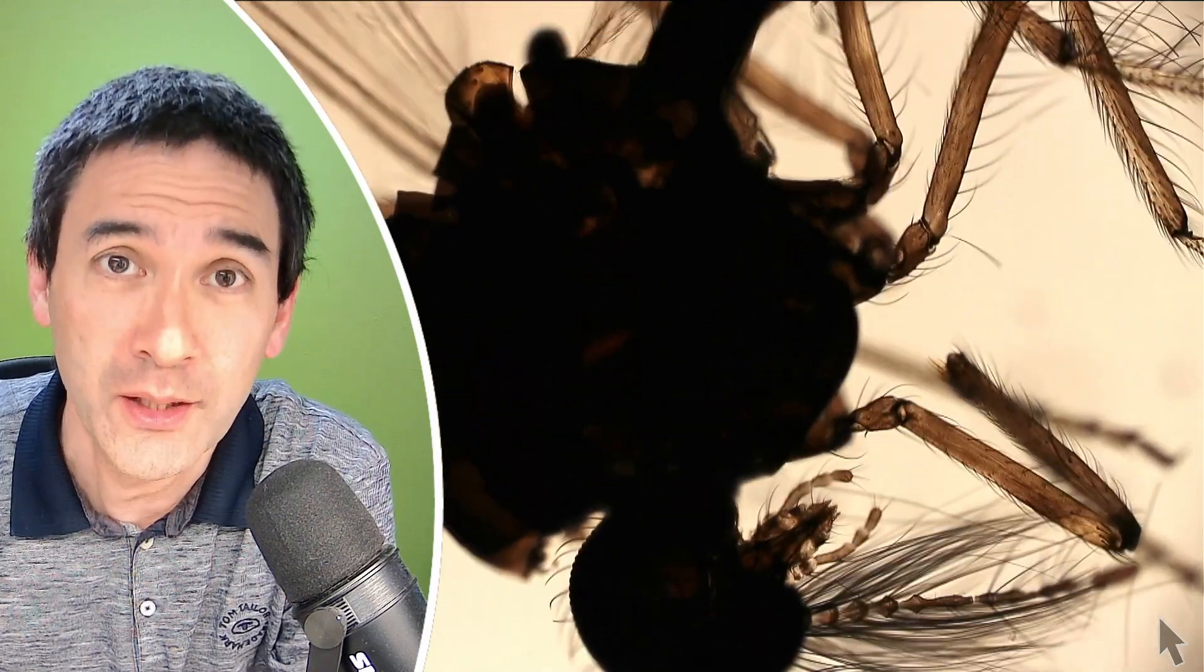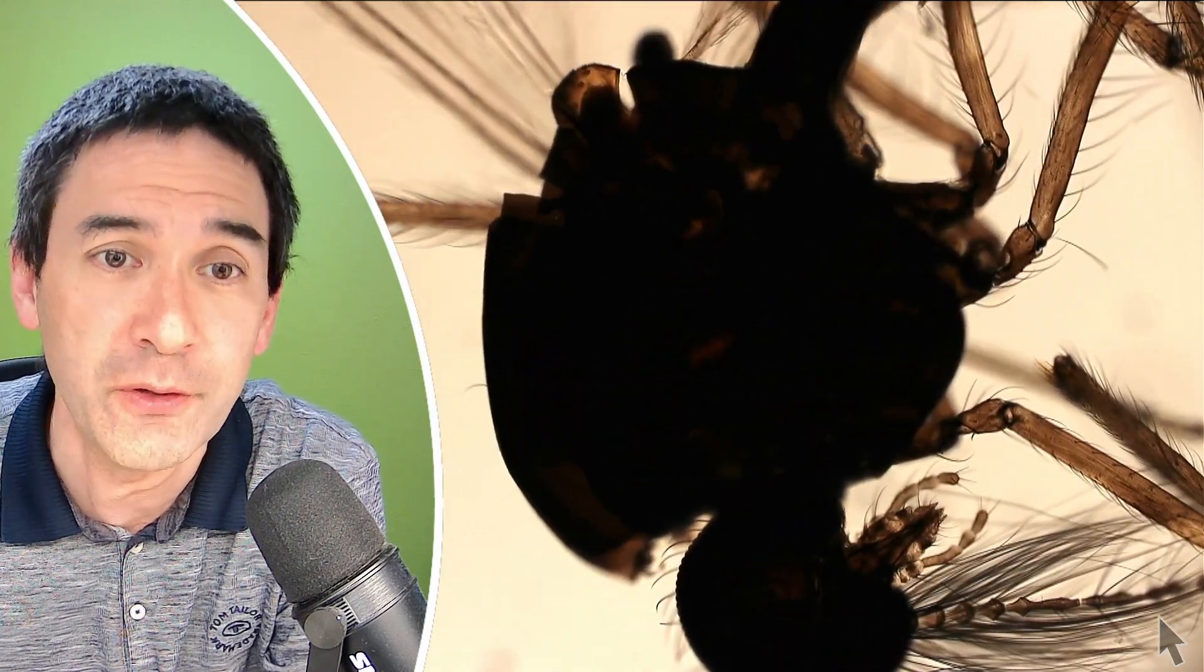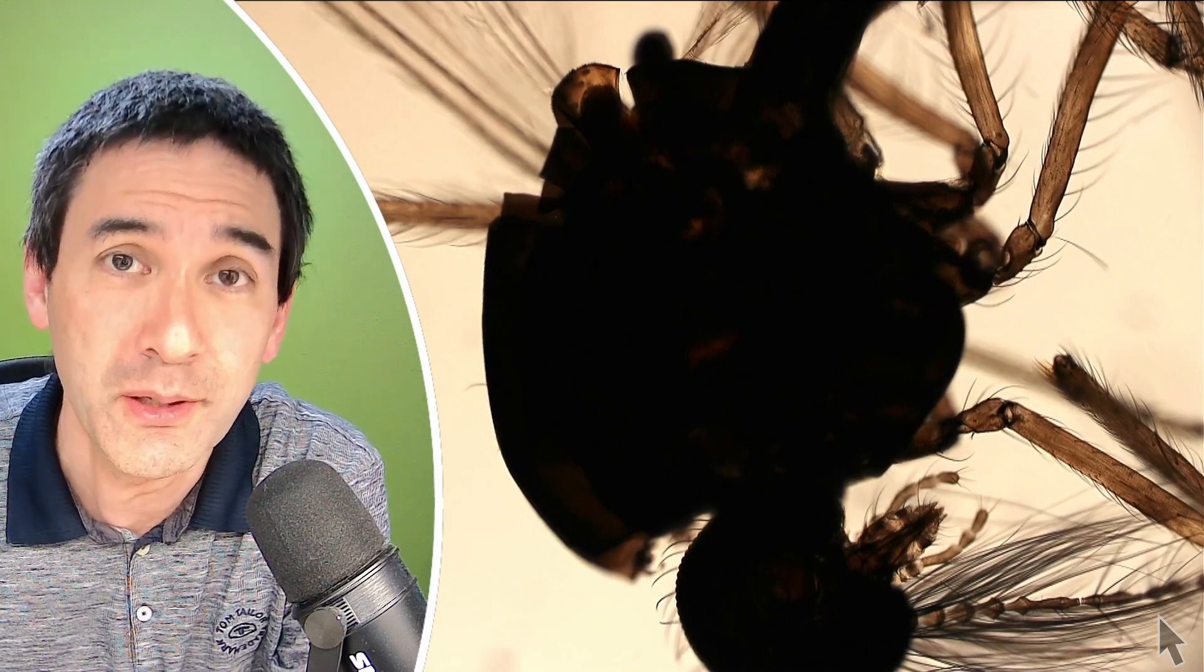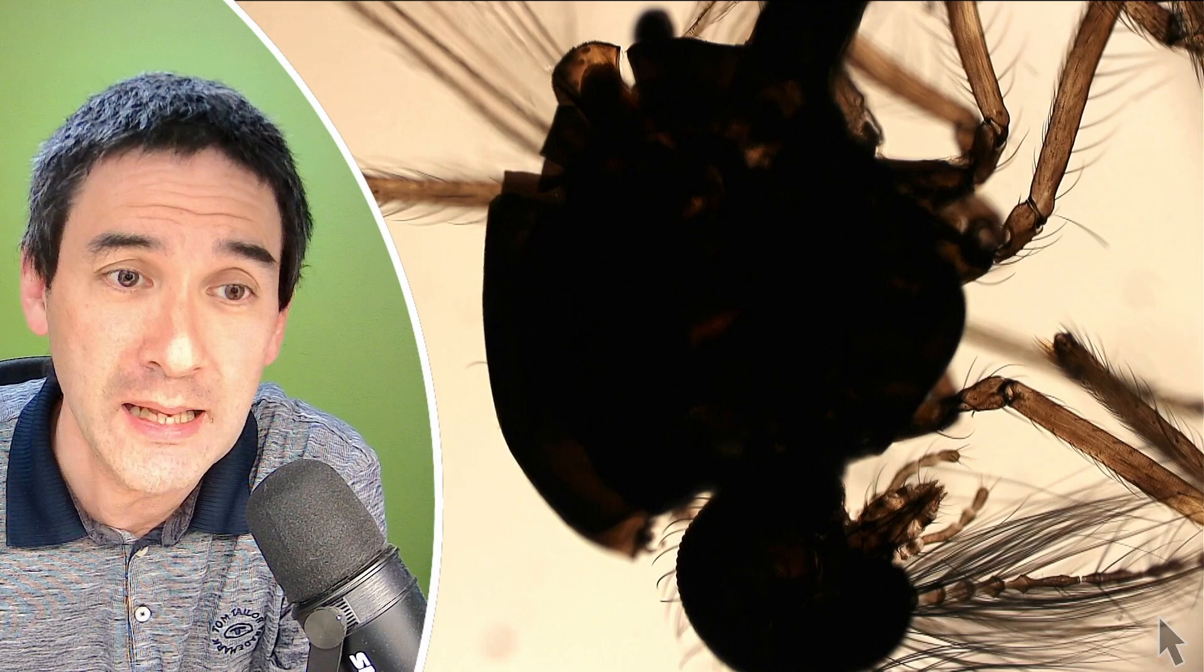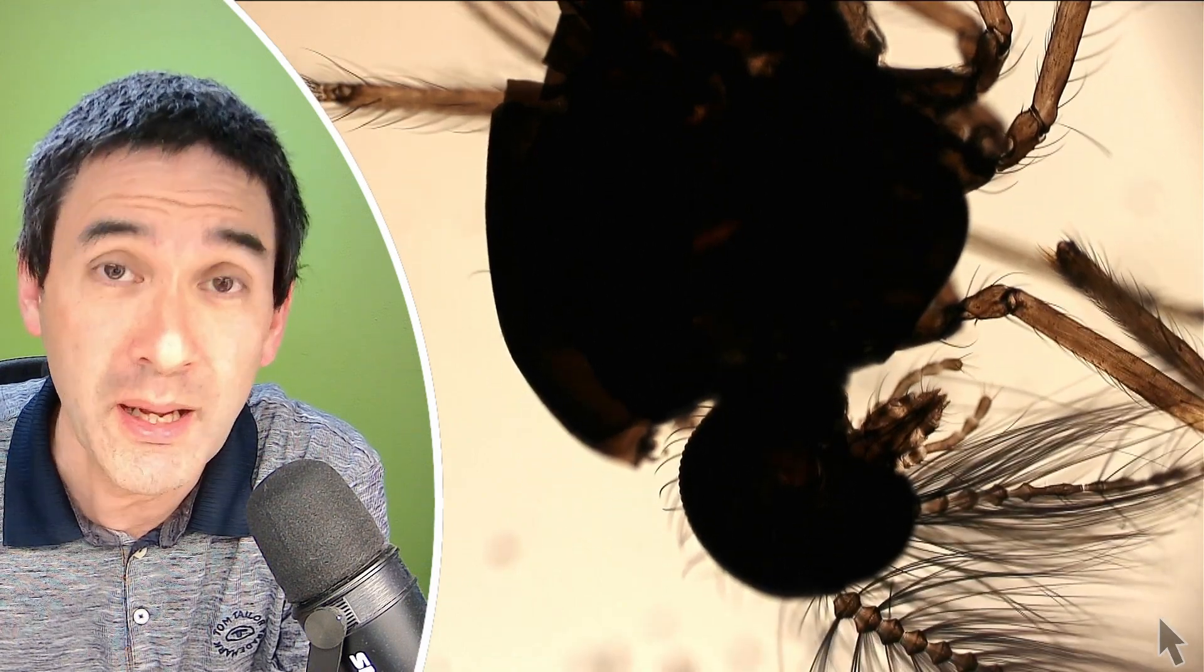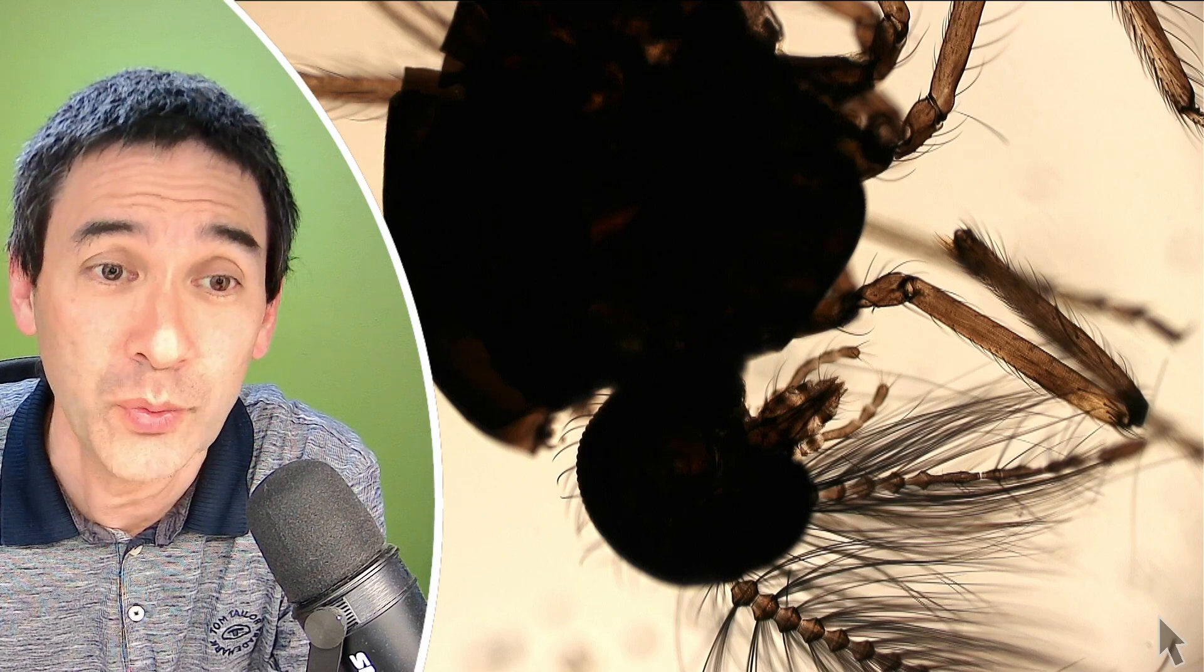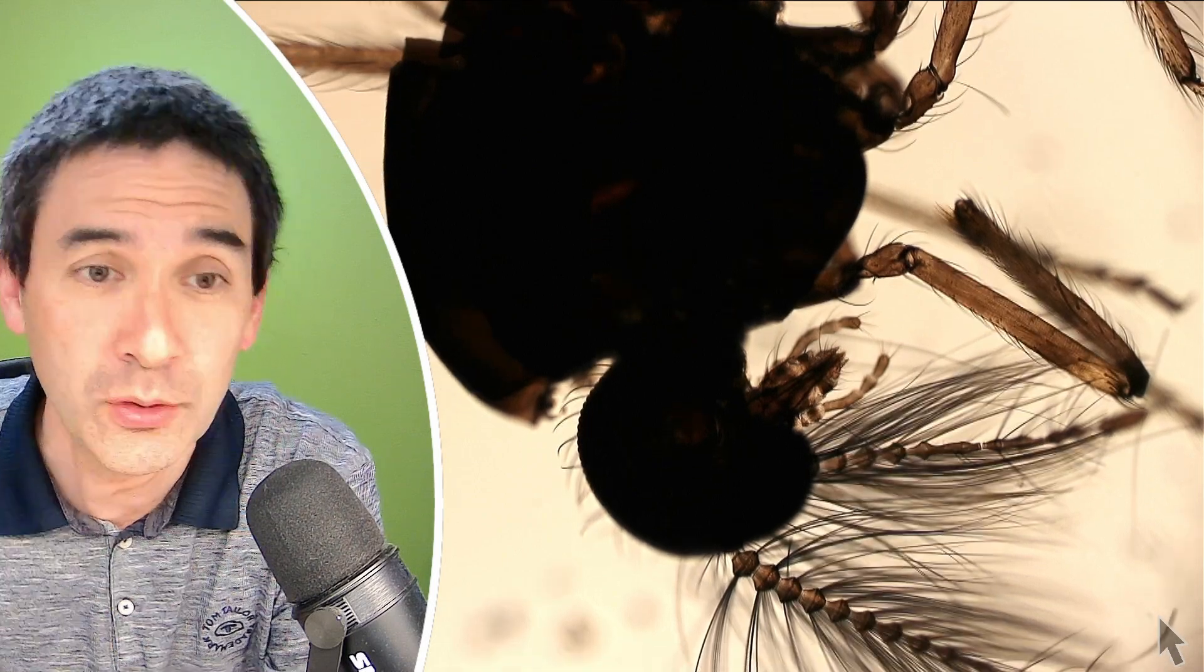Now, first of all, I know, a little bit unfortunate, it's a fairly dark specimen. It is actually not very transparent and for this reason it looks like a black shadow here. I do hope that the mounting medium is going to start clearing this specimen over the next couple of weeks. But let's go back to the topic.